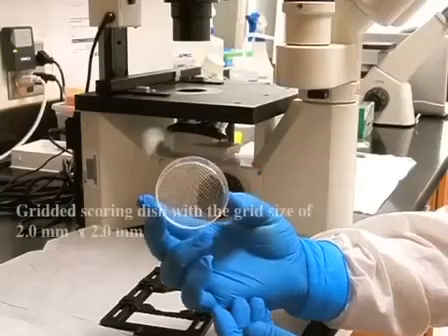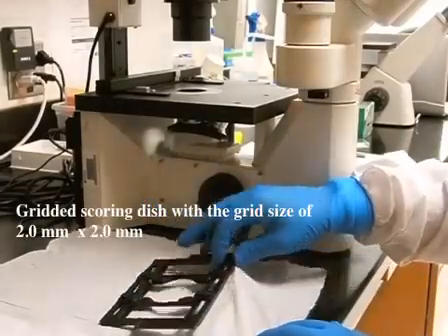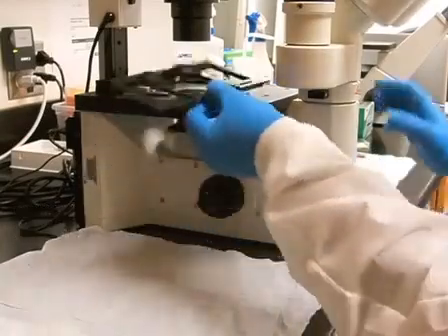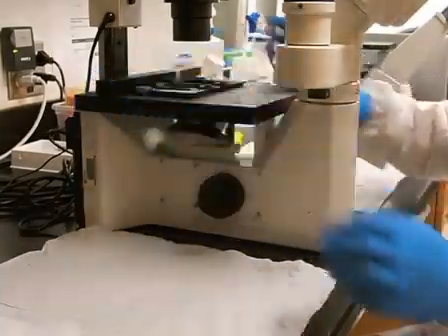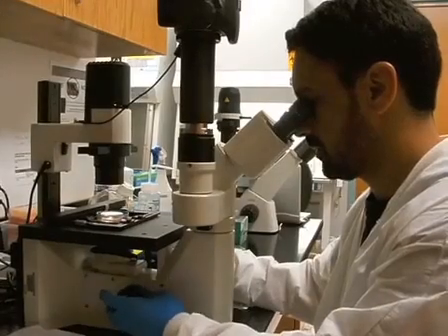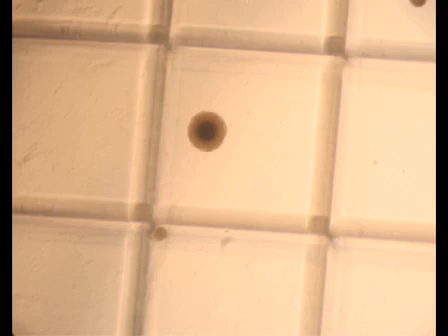Each culture dish is placed on a gridded scoring dish of grid size 2 mm by 2 mm and then placed on the microscope stage. Using a low-power objective lens, each dish is scanned and colonies are scored based on their size. Here are representative results of the assay at the end of the first week. At this time point, neural stem and progenitor cell-derived colonies are indistinguishable.